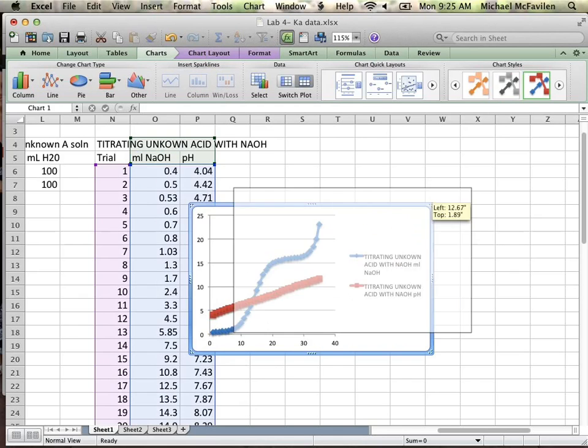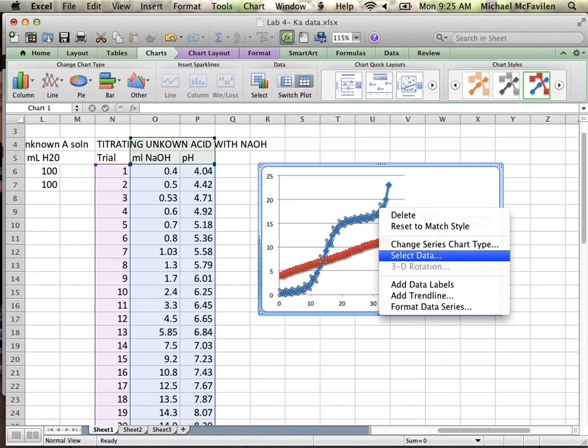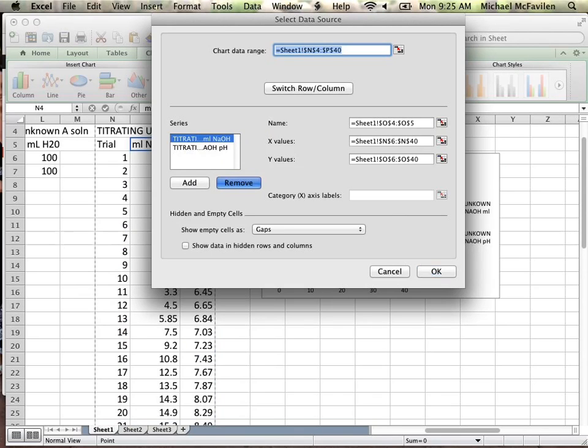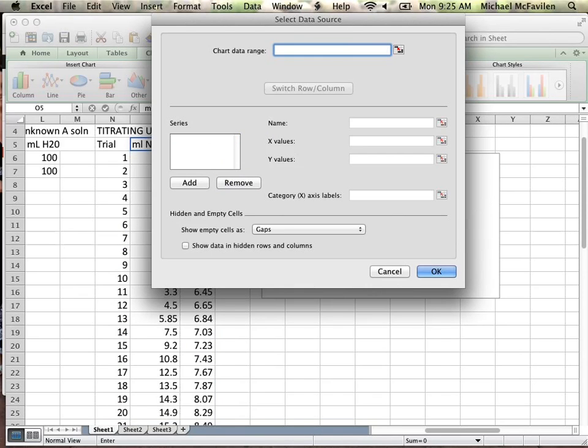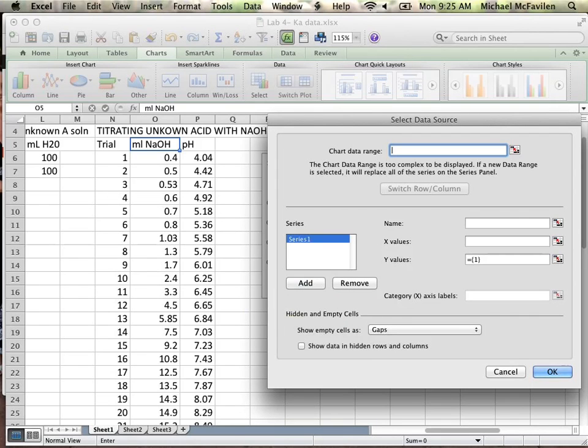Sometimes Excel likes to decide that it wants to plot everything for you. Since I think that's a lot of crap, we're just going to delete it all. So in theory we should start with just an empty graph screen. What we'll do is now add a series. In this case we're looking at just your pH titration curve, so nothing fancy. On your x-axis you want to put the independent variable, so the one that doesn't change. That's going to be your volume.